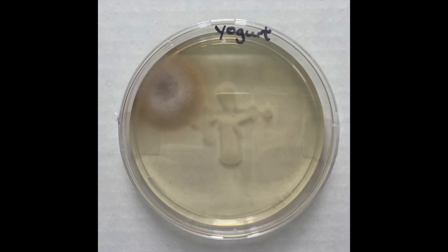Looking at the yogurt plate, we see that there is actually a contaminant on this plate — it looks like some type of mold is growing on there. We know it's a contaminant because it's outside the streak area from the initial swabbing that we did.